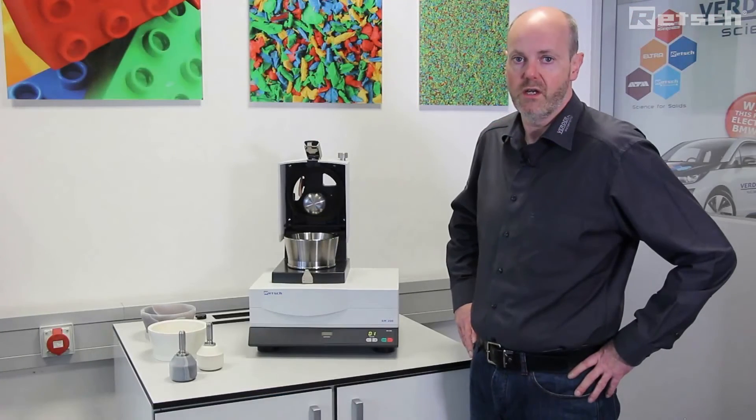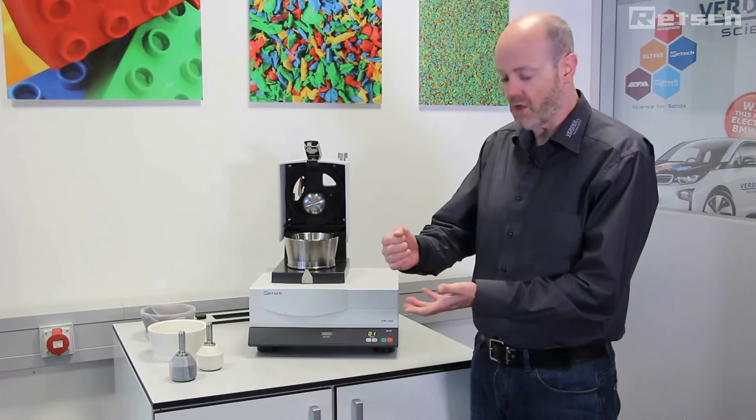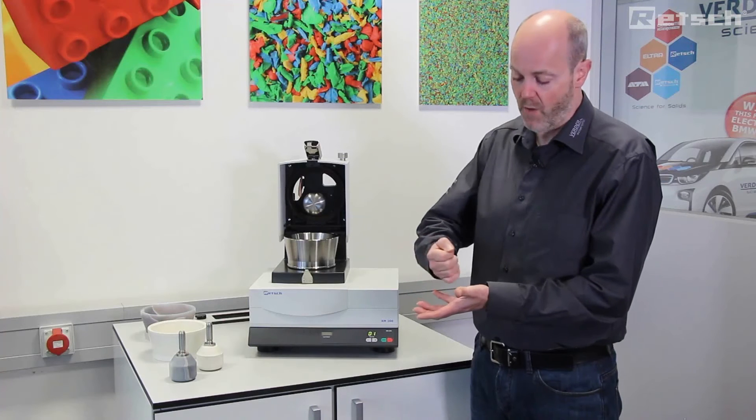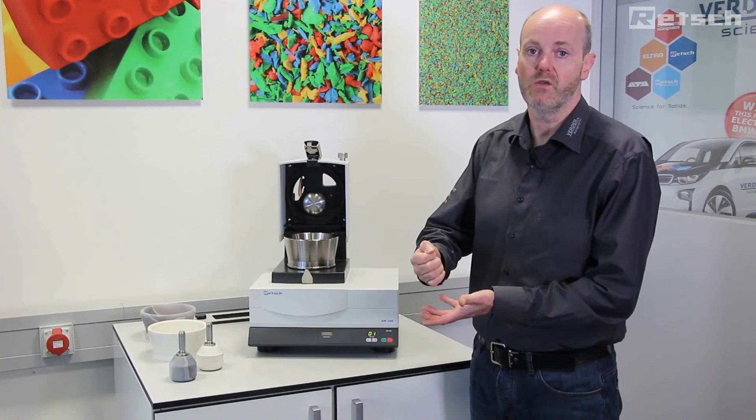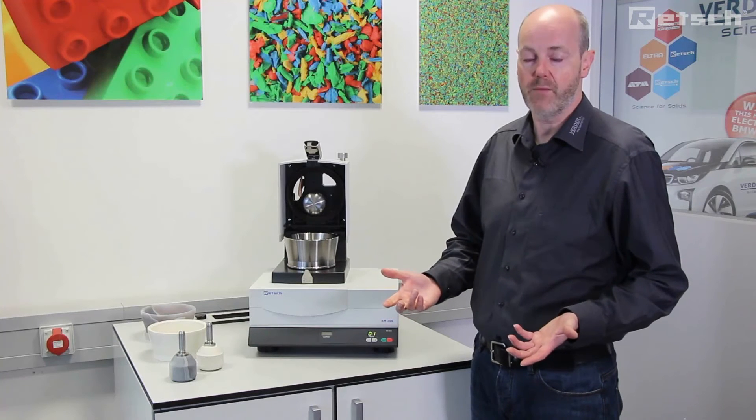Mortar grinders are very frequently used in all areas of scientific research and are commonly used to substitute clients who are preparing samples manually using a hand pestle and mortar. Therefore, they can be seen as a labor-saving device.